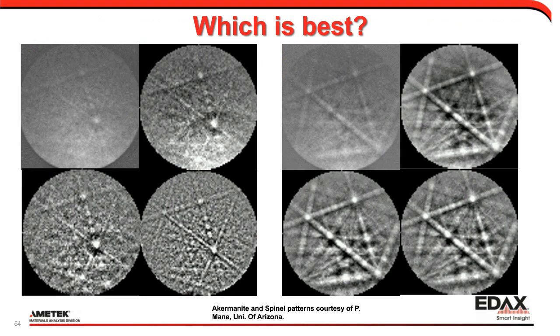So the big thing to realize here is that what is best for the phase on the left might not be best for the phase on the right, or the other way around. Basically, I no longer have to pick and choose at the beginning of my sample what works for everything. I can actually pick and choose what works for each phase individually.